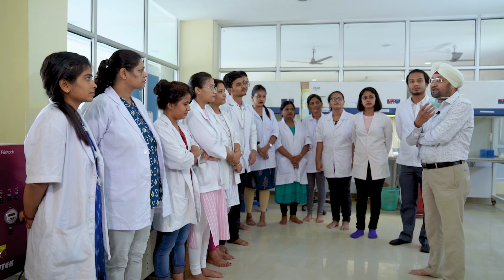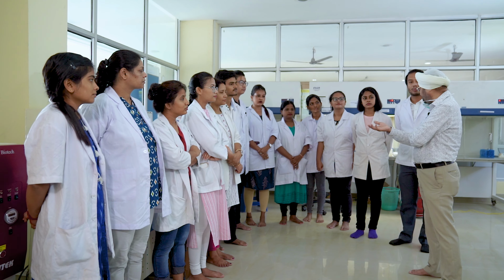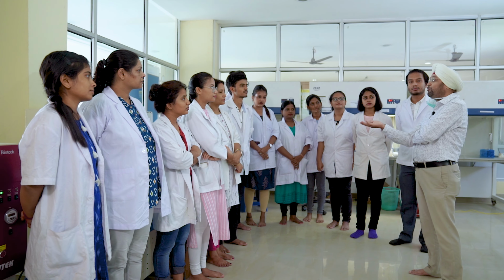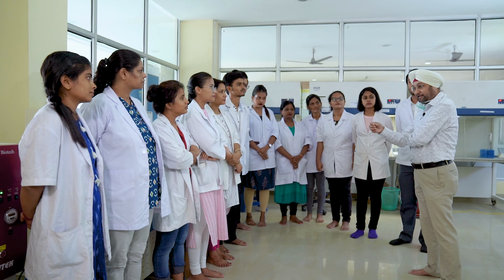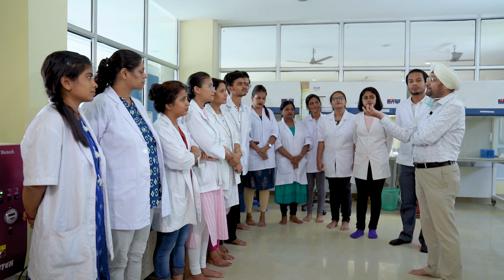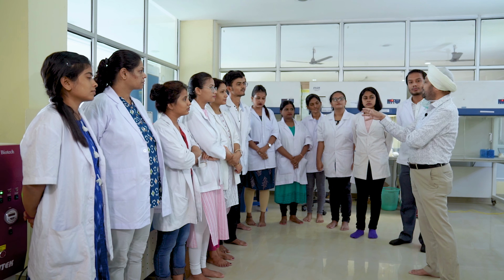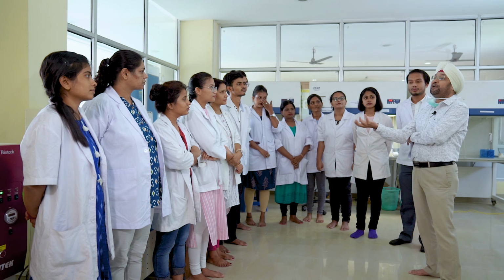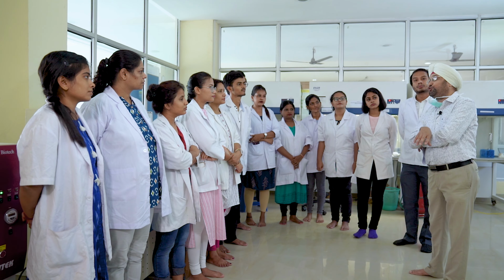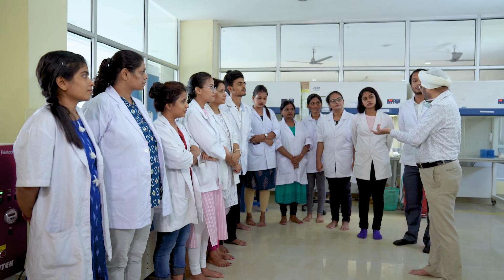In the wild strains of Agrobacterium, they also transfer their own genome into the crop plant, particularly host-specific ones like dicot plants. But using this advantage of Agrobacterium as a natural genetic engineer, we are now using Agrobacterium to transfer our own gene of interest into different crop plants.